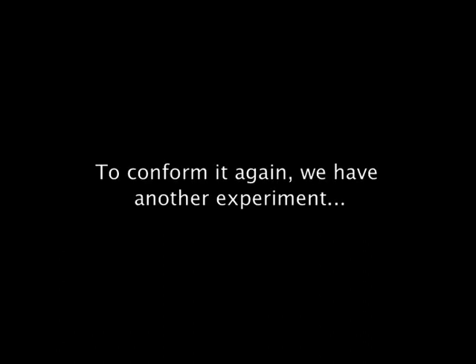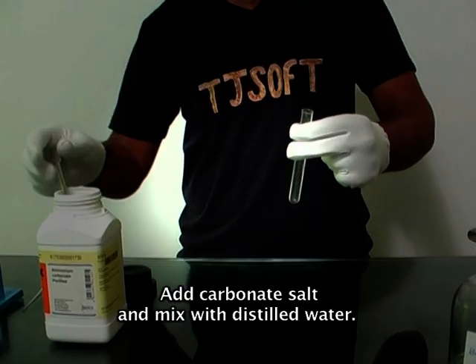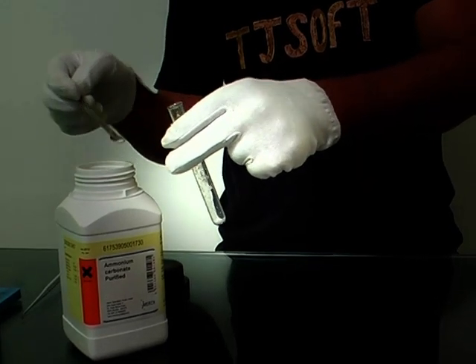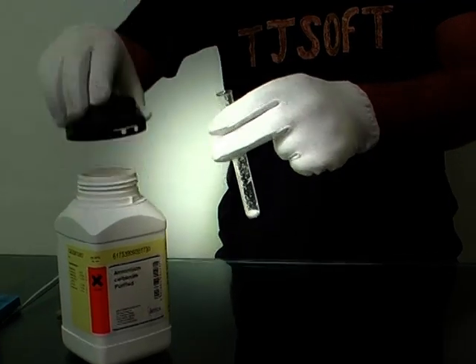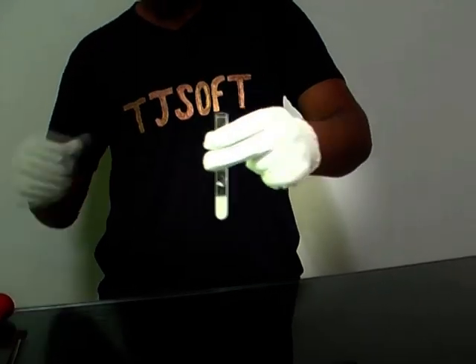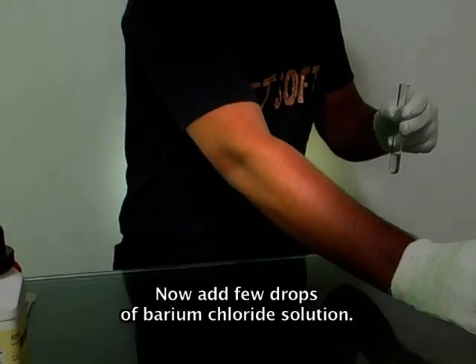To confirm this again, we have one more experiment. Take a clean test tube, add carbonate salt and mix with distilled water. Now add a few drops of barium chloride solution.